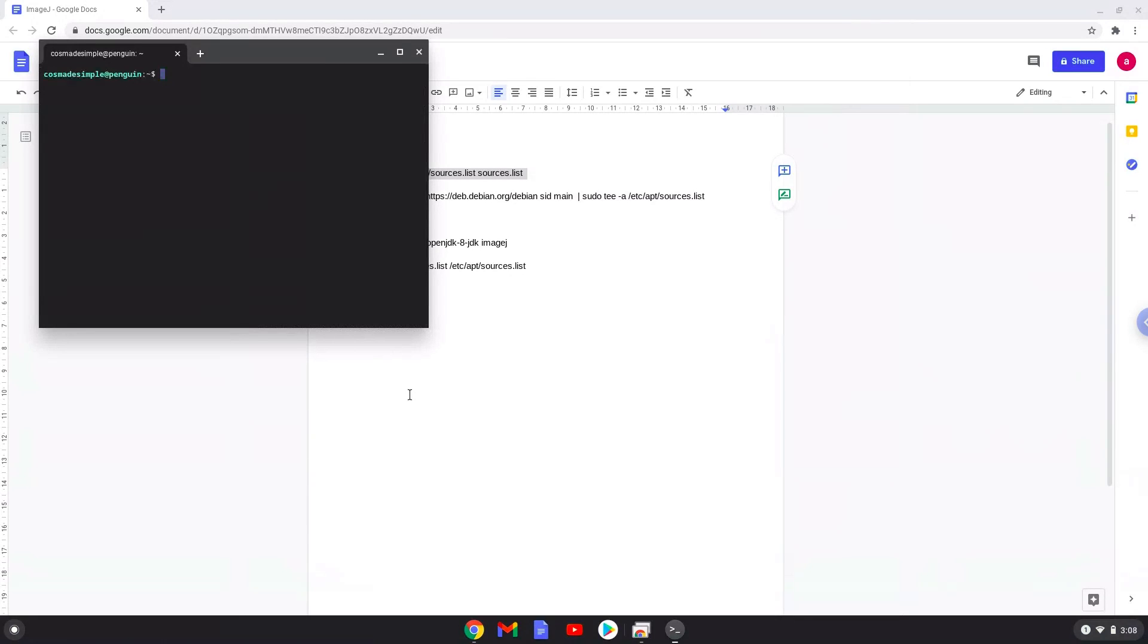We do this because during this tutorial, we will modify the source file, and in the end, we will revert it to how it was with this copy. This command should run automatically as soon as you paste it into a terminal session.